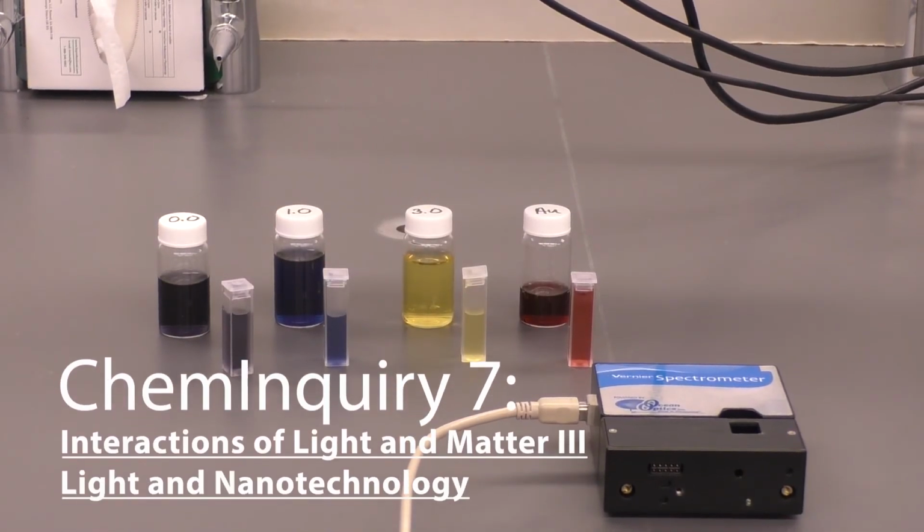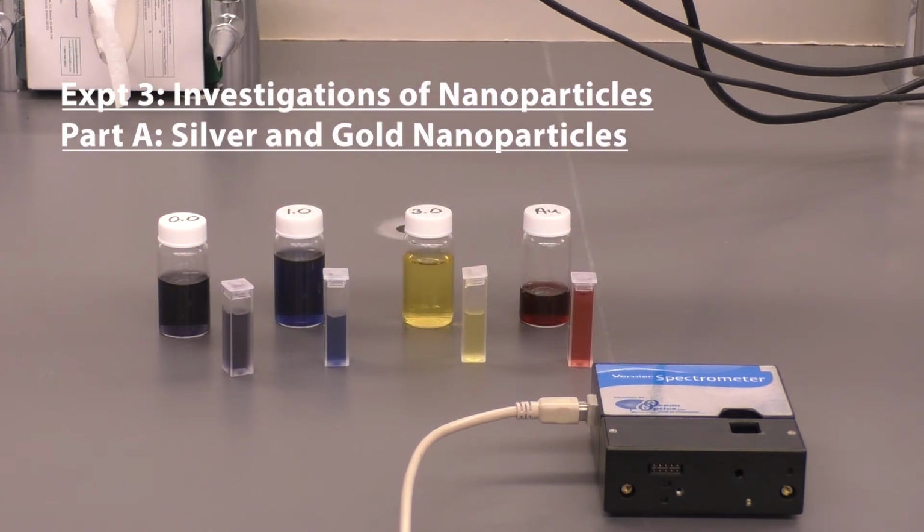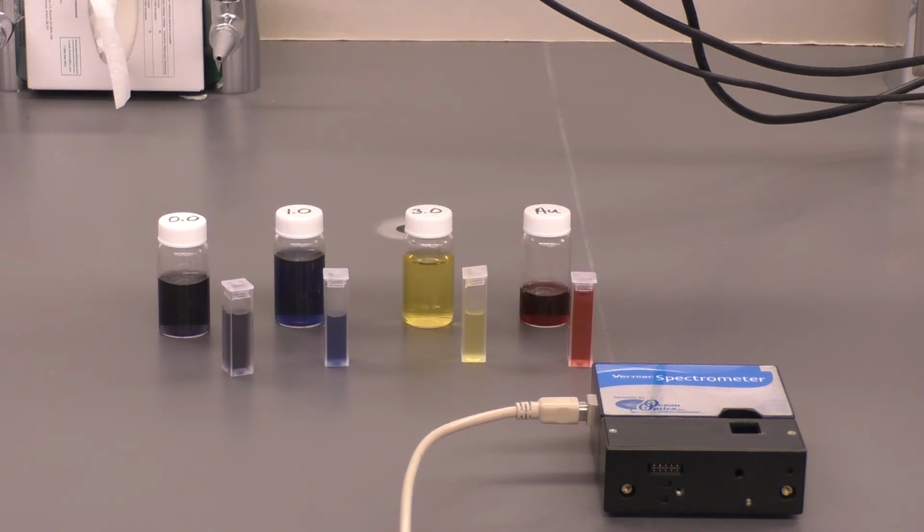This is Chem Inquiry 7, Experiment 3, Investigations of Nanoparticles. So here we have the solutions set up to be measured in the spectrometer. And you can just see them there for reference. Ours had continued to develop over the last few weeks, a little bit different color than we originally started with. So we've actually taken these spectra already. And so let's just take a look at the results real quick, and then you'll be provided with this data.